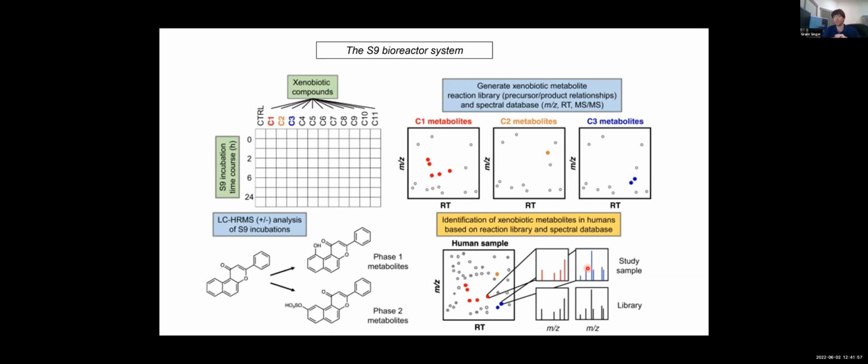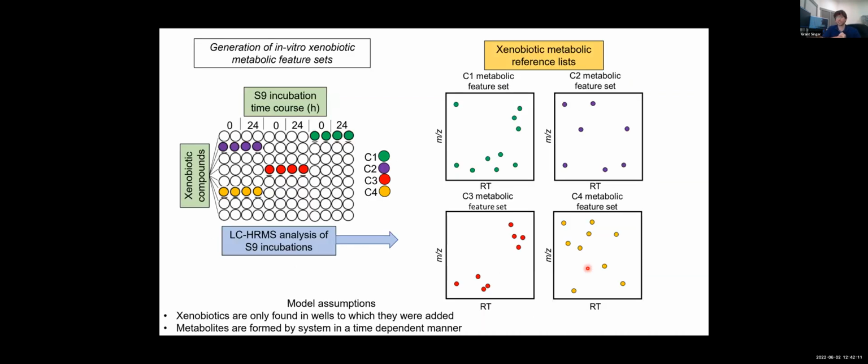So now we're working on applying this approach to large scale untargeted human data with mass spec reference data curated from over 1,000 xenobiotic reactions. Manually rifling through the data isn't really cutting it. So our solution to scale starts with using Python to rapidly group unique features from these S9 extracts into metabolite sets, with each set containing precursor and product MZs and RTs. These can be used as xenobiotic exposure profiles of sorts that can be found in human samples exhibiting the exposure.